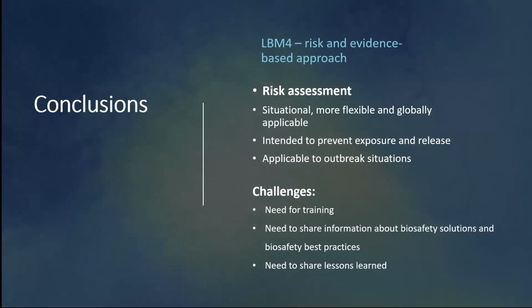And then finally, the LBM-4 emphasizes a risk and evidence-based approach to biosafety. Risk assessment, some of the main characteristics: it's situational, it's very flexible and globally applicable and therefore very equitable based on resources. It's intended to prevent exposure and release, and it's applicable to outbreak situations, as we just evidenced when we went through the exercises.